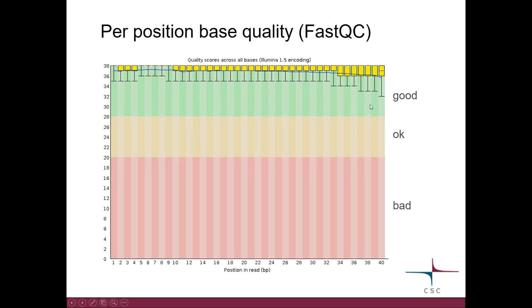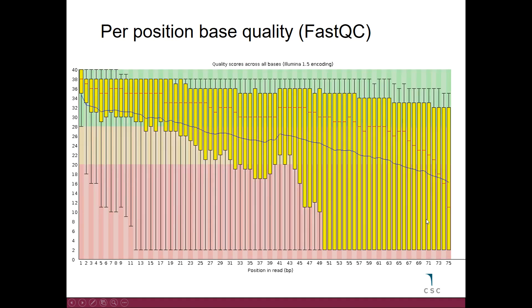Here we have an example of not-so-good data. As you can see, the mean quality value goes down towards the end of the reads. This is a bit older data — current sequencers cope better. But even with modern sequencers, if you make very long reads, the base qualities start to drop towards the end.